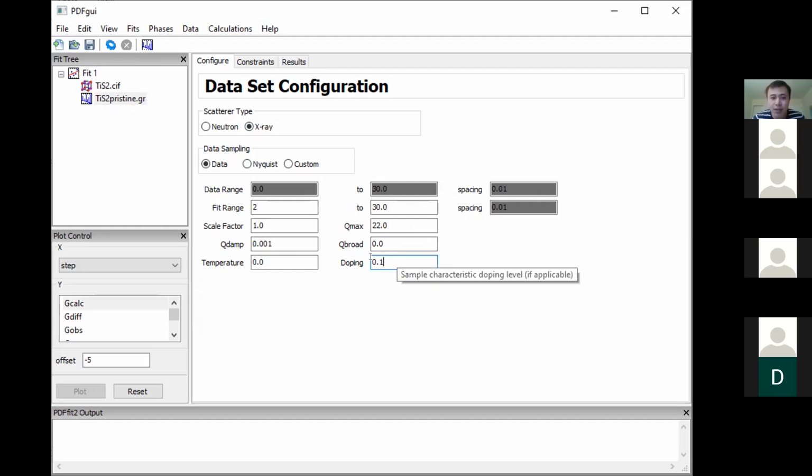Yeah, the same thing is for temperature. You can remind yourself, oh, this data was taken at room temperature, 300K, and that was taken at 200K, that was taken at 100K. Then when you input all the files, you have multiple files here, you can remind yourself which is which. So it doesn't affect the fitting of the data, right? No, it has nothing to do with the fitting.